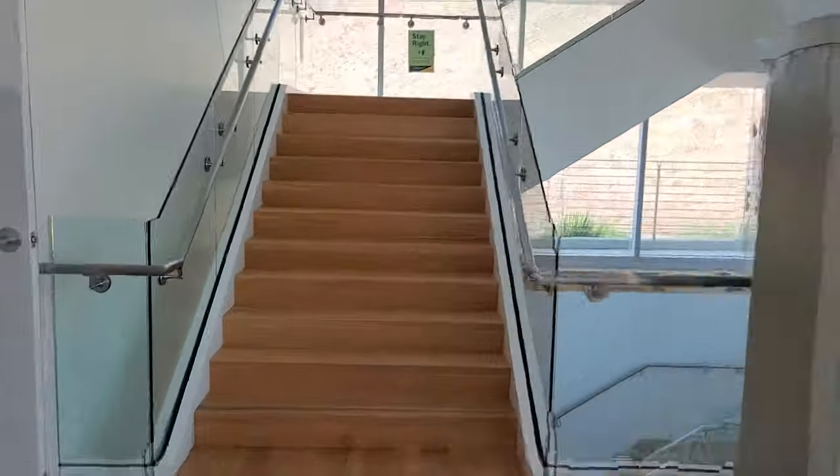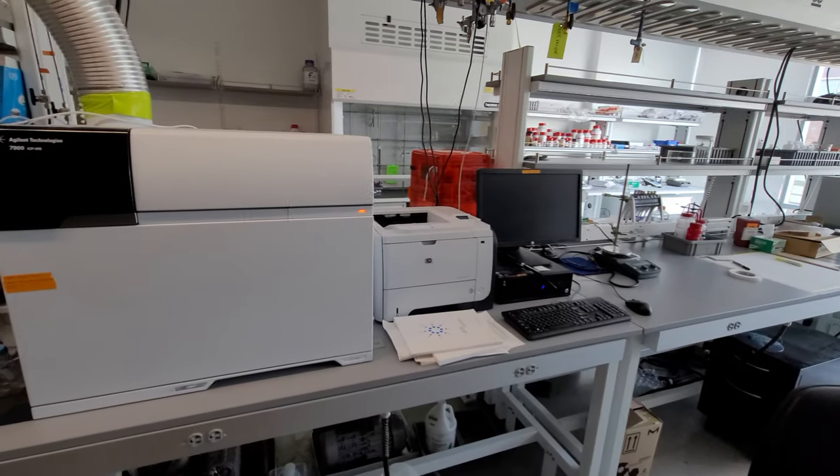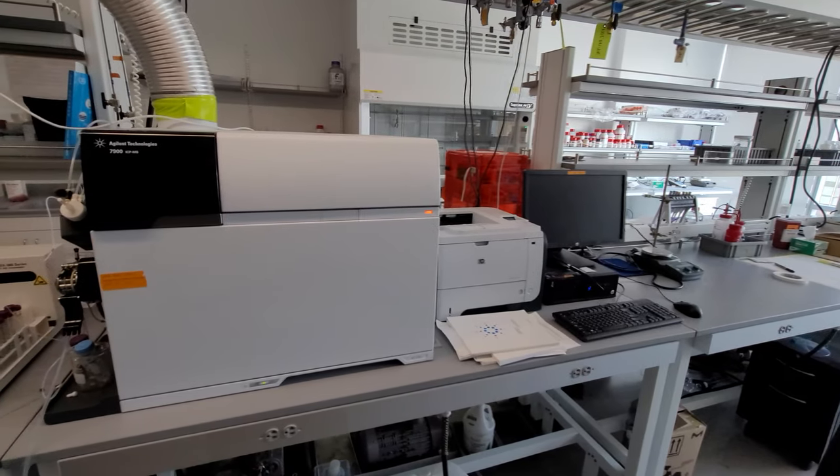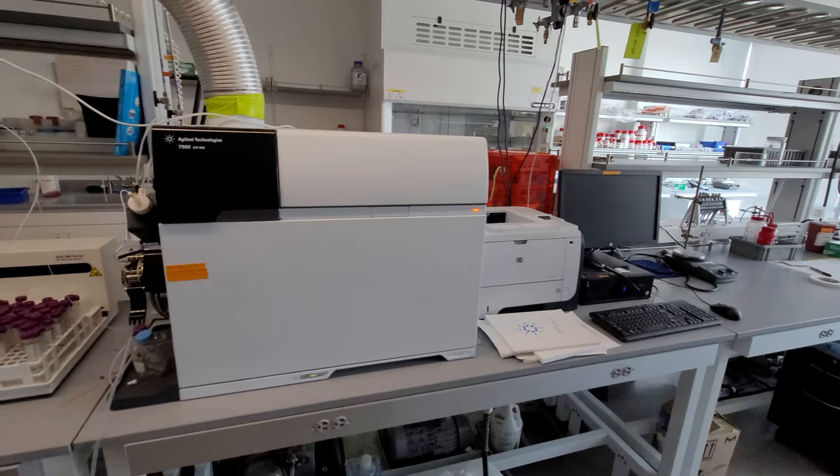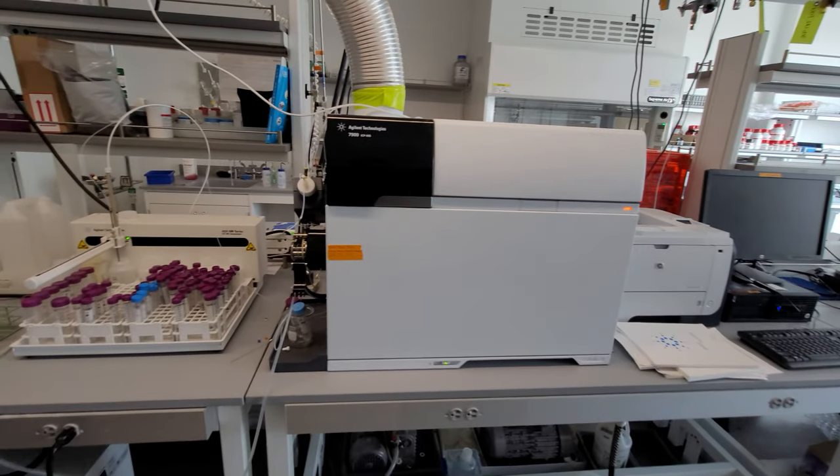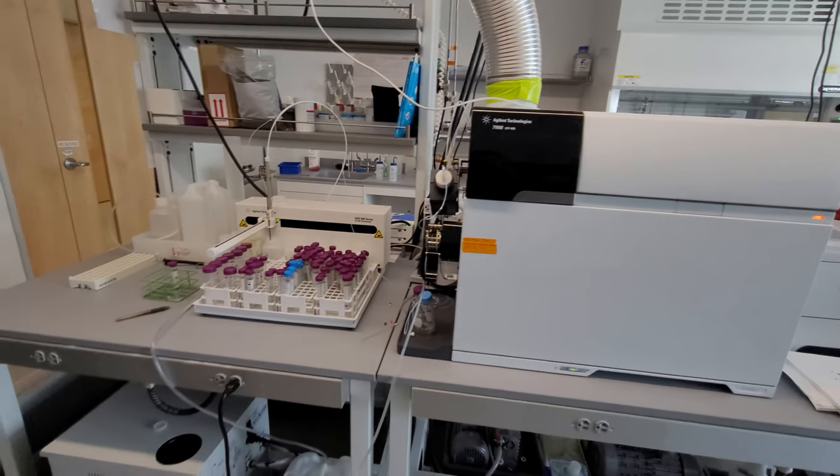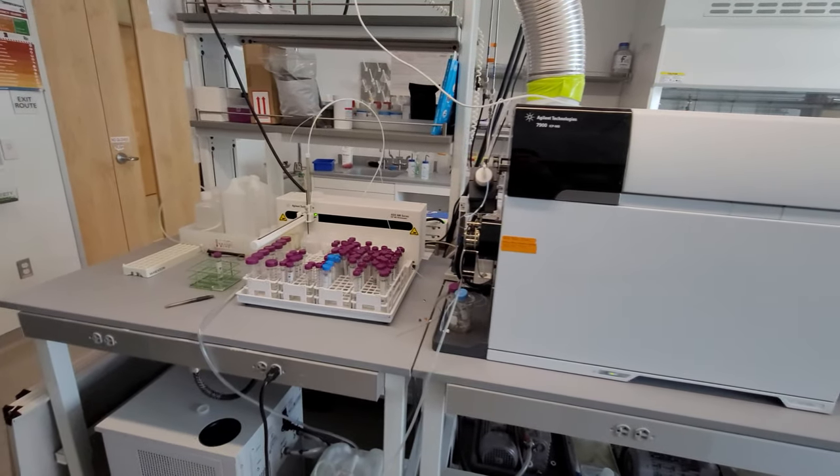Having explored the first-floor deposition and characterization labs, let's head upstairs to take a look at the wet chemistry synthesis and testing labs. As many materials tend to decompose by dissolving as soluble compounds of their component elements, sensitive quantification of aqueous concentrations, aided by inductively coupled plasma mass spectrometry, of those elements can help to understand decomposition rates and mechanisms in hopes of improving it.